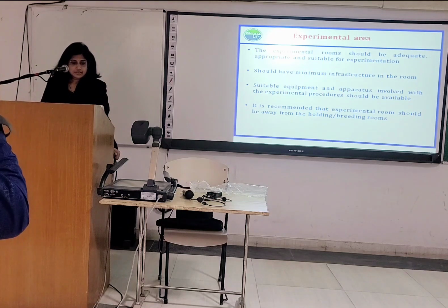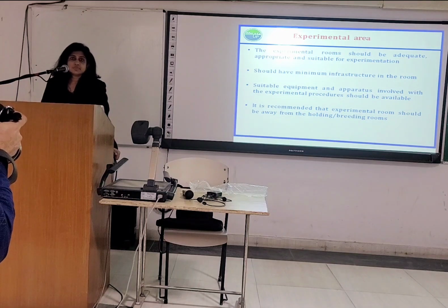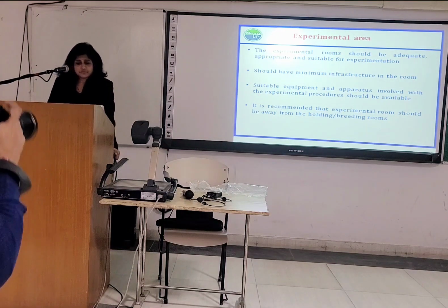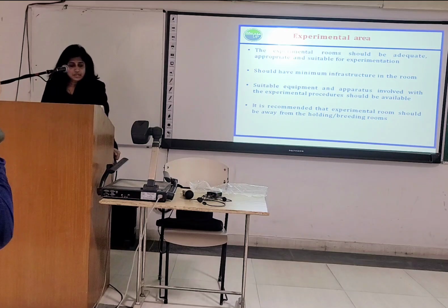The experimental area. The experimental rooms should be adequate, appropriate and suitable for experimentation. It should have minimum infrastructure in the room. Suitable equipment and apparatus involved with the experimental procedure should be available. It is recommended that experimental room should be away from the holding or breeding rooms.